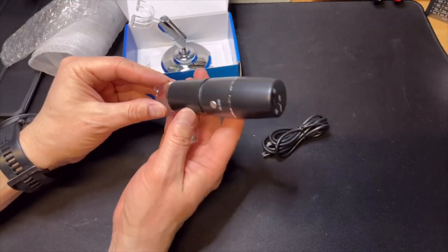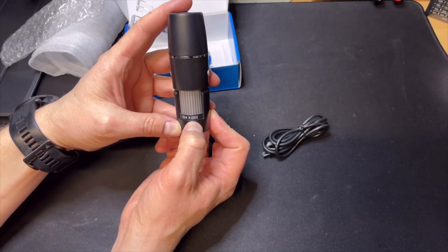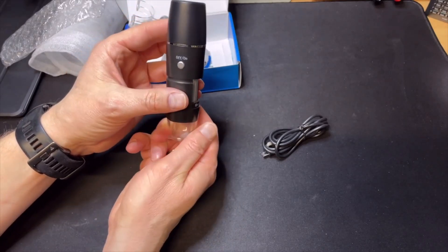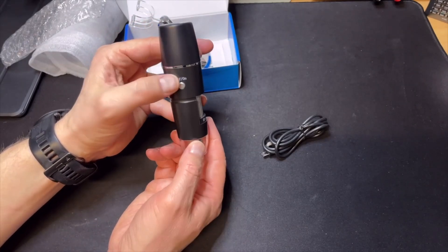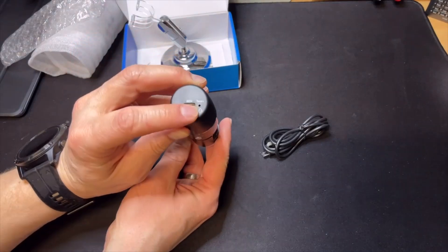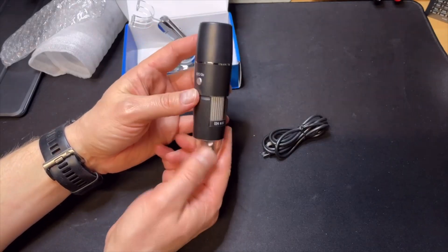It does look very similar to the larger model. It goes up to 1000x magnification; there is also a model that goes up to 1200 or 1600, but that is the other version. You can switch it on, but the battery is dead right now. There is even a snapshot function — let's first charge it.